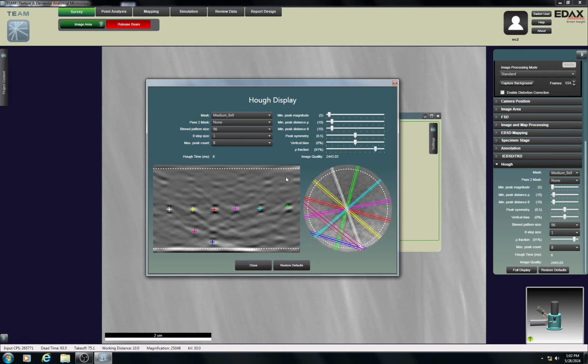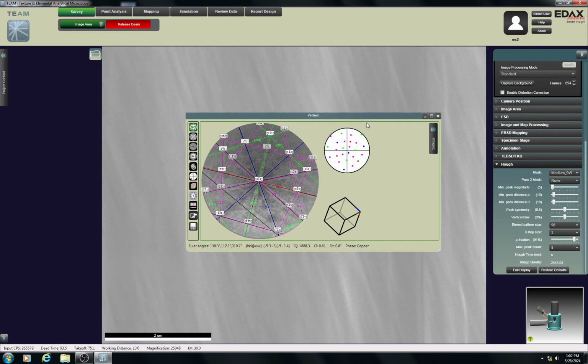I don't know. The other thing you can do is this vertical bias function. In the pattern, there's always going to be some spot where there's better quality. Let me just show you. If I go back here to this view and turn everything off, you can see up at the very top, it's kind of blurry. At the very bottom, it's kind of blurry. It's really nice in the center right now, but this changes with working distance.